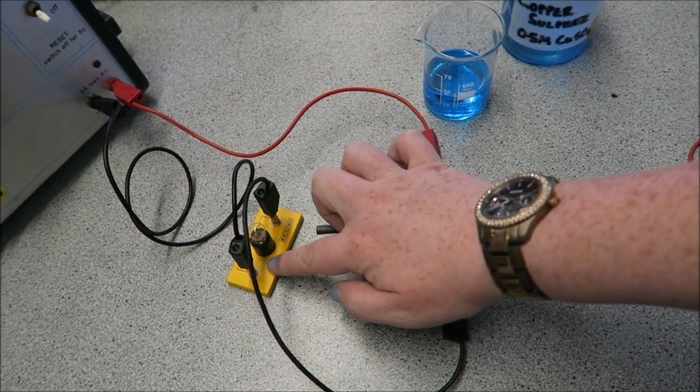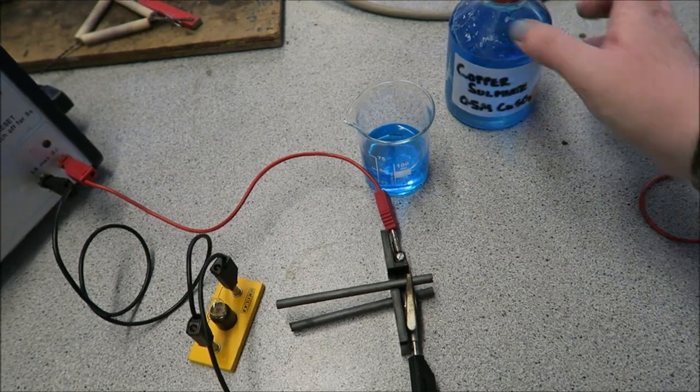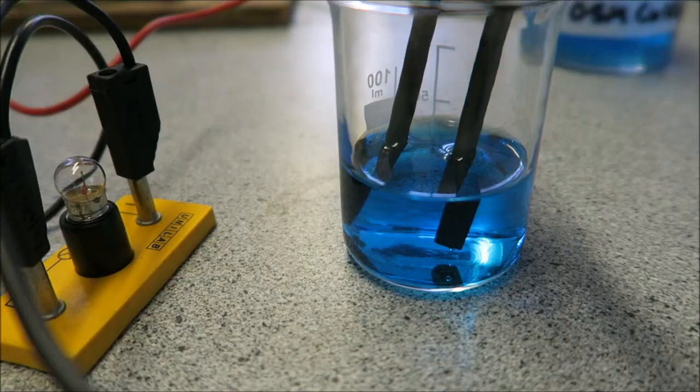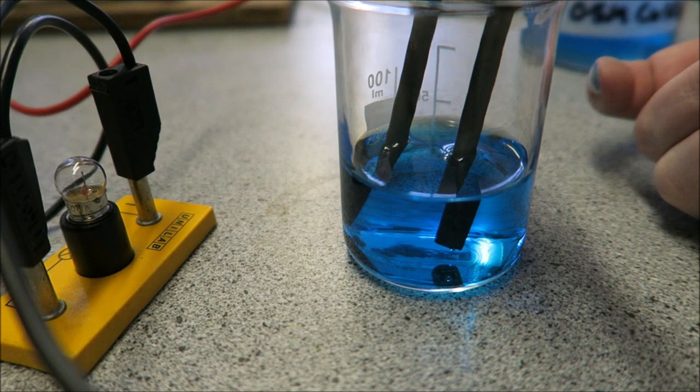This is connected through the bulb, just so we can see it working. We've got our beaker of copper sulphate and then we can just pop that in there, turn it all on and watch it go. So I have my two electrodes in my copper sulphate. You can see that it is not touching.